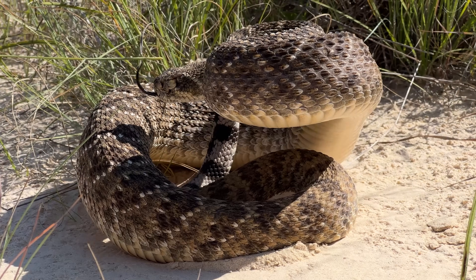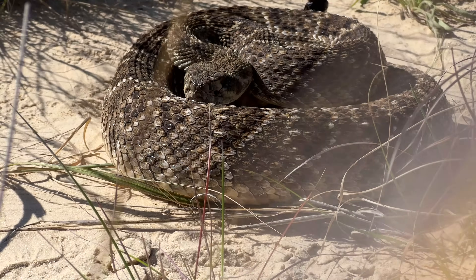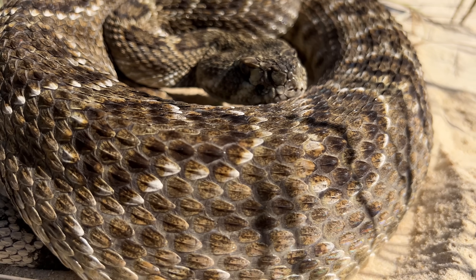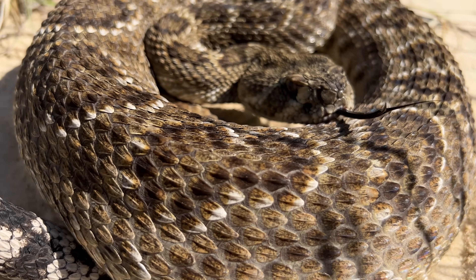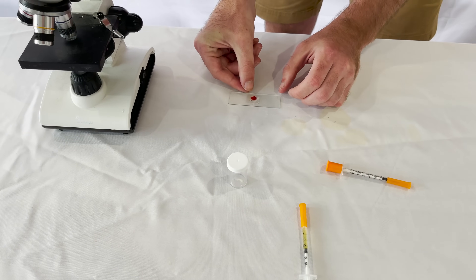The rattlesnake has the most feared snake bite in North America. But how does the snake actually kill you? And what does the venom do to the human body? Today, we're going to simulate a rattlesnake bite by adding venom to human blood.